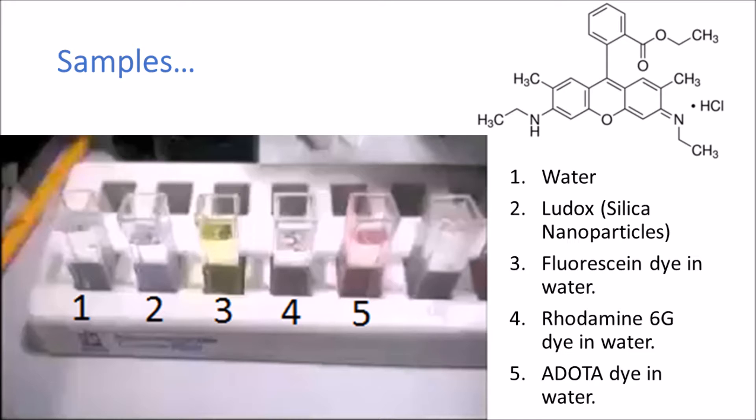The third, fourth and fifth solutions are fluorescent dyes in water. I have fluorescein dye, rhodamine 6G dye, and ADOTA dye.